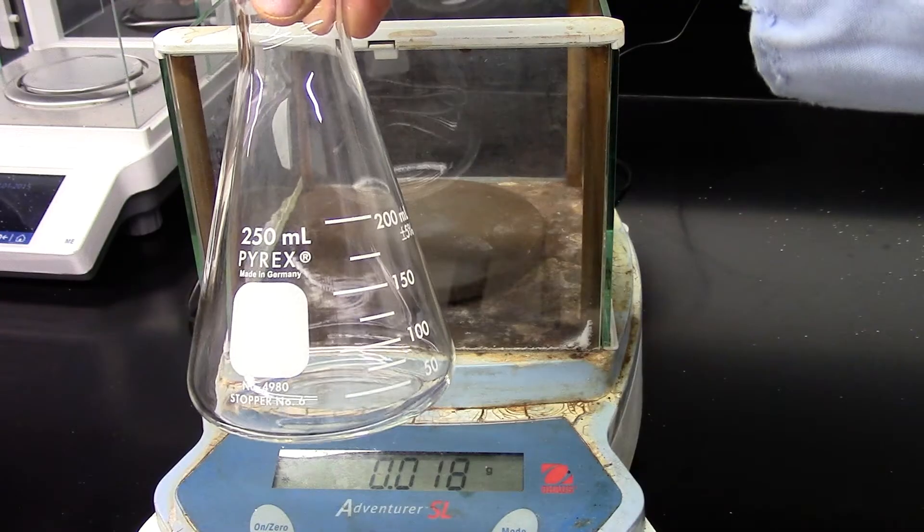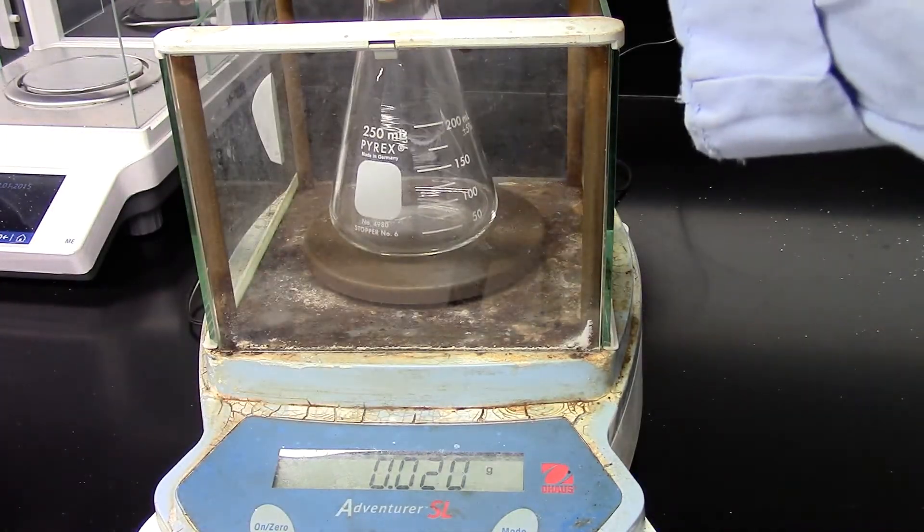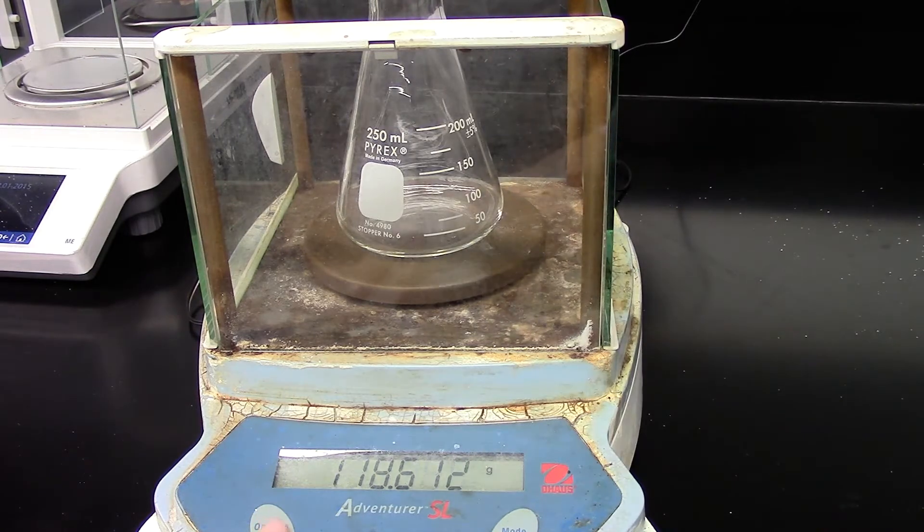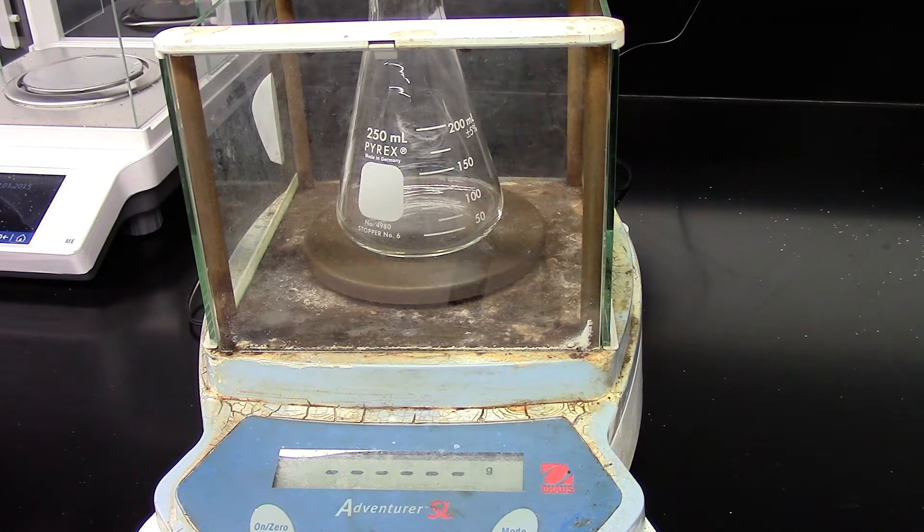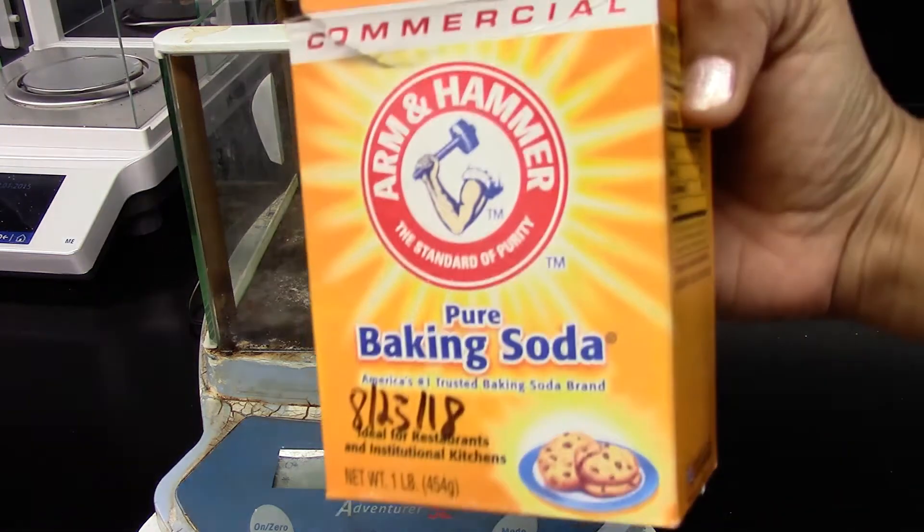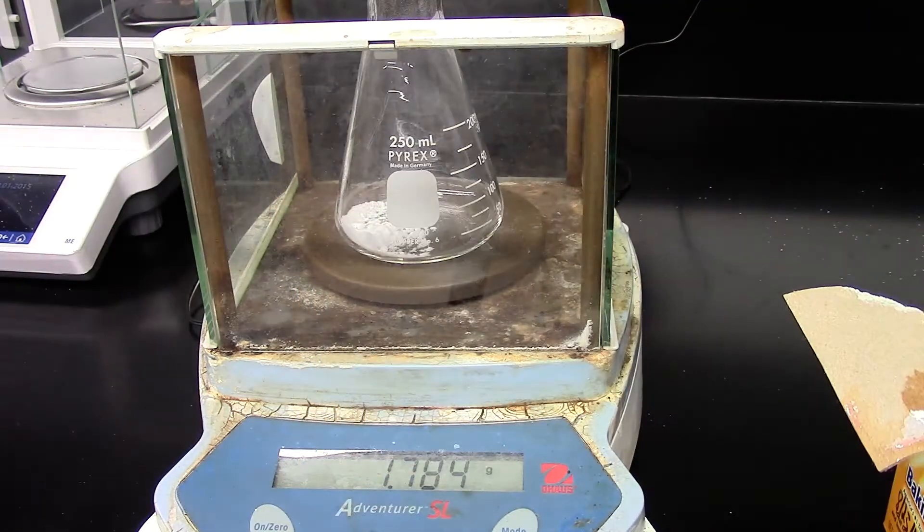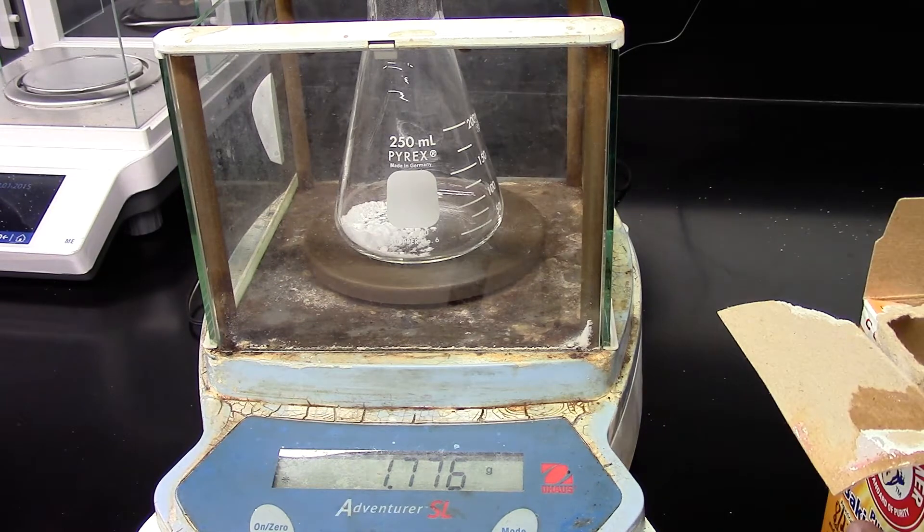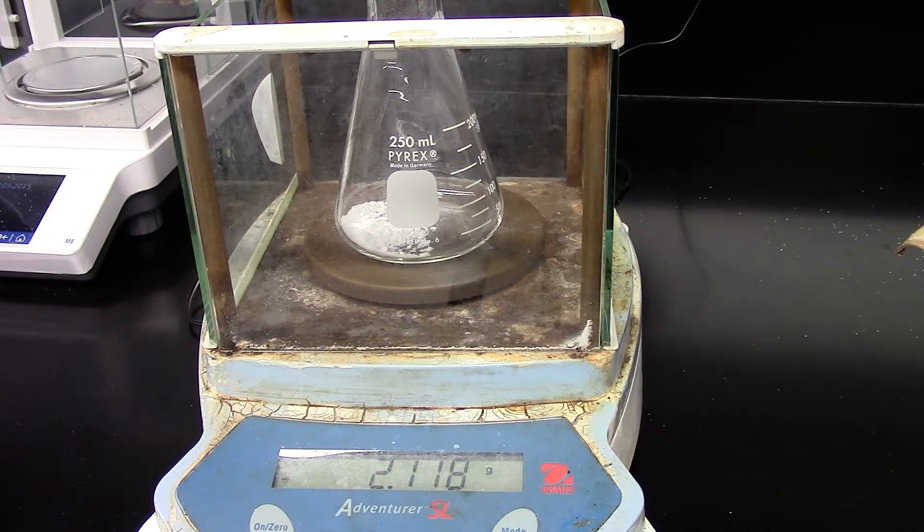250 milliliter Erlenmeyer flask. Place it on the balance. Tare it. And weigh about two grams of bicarbonate which is baking soda. So we weighed 2.118 grams of baking soda.